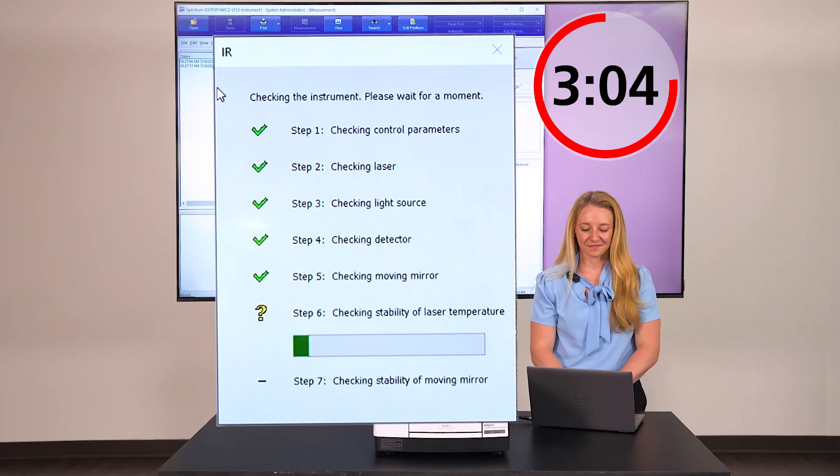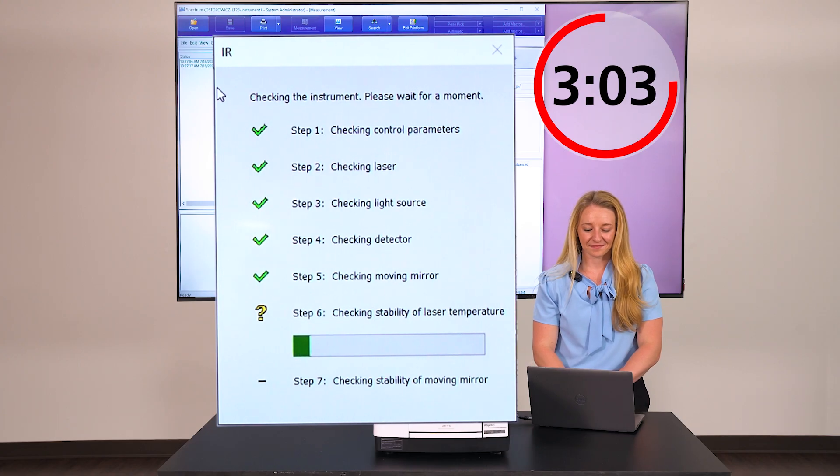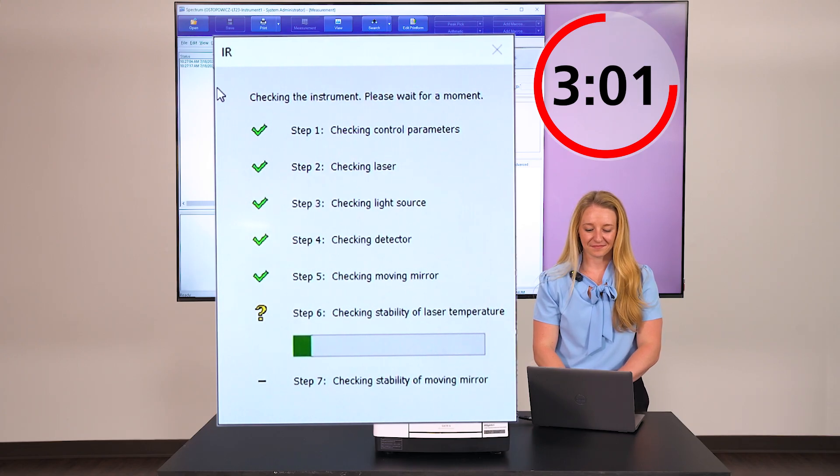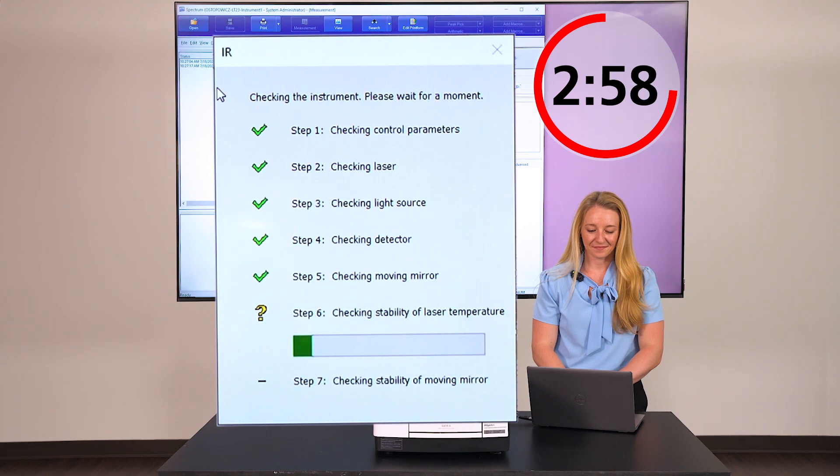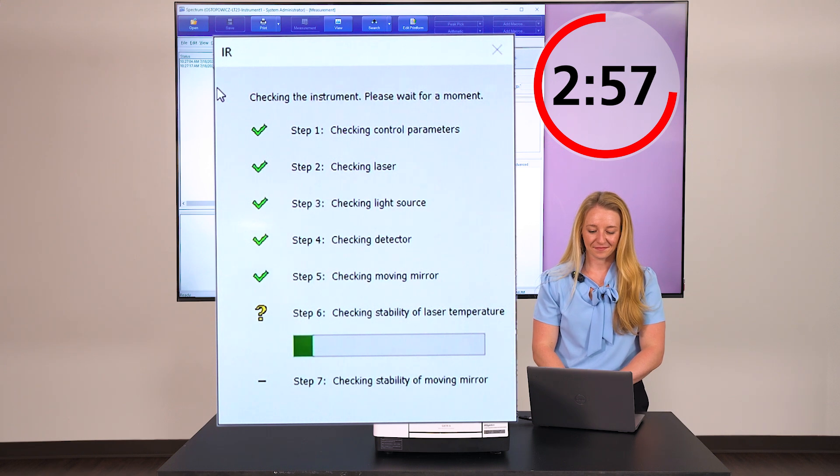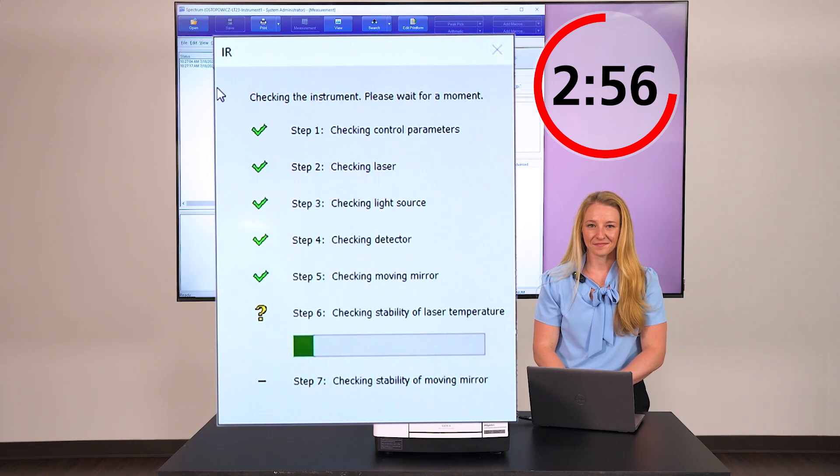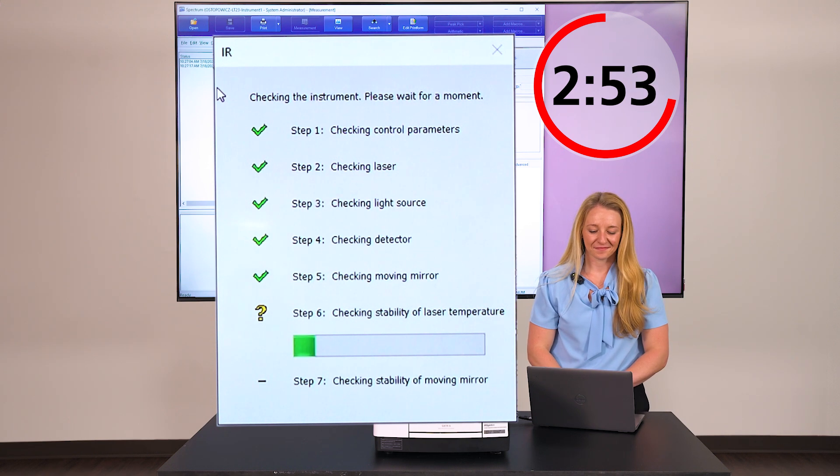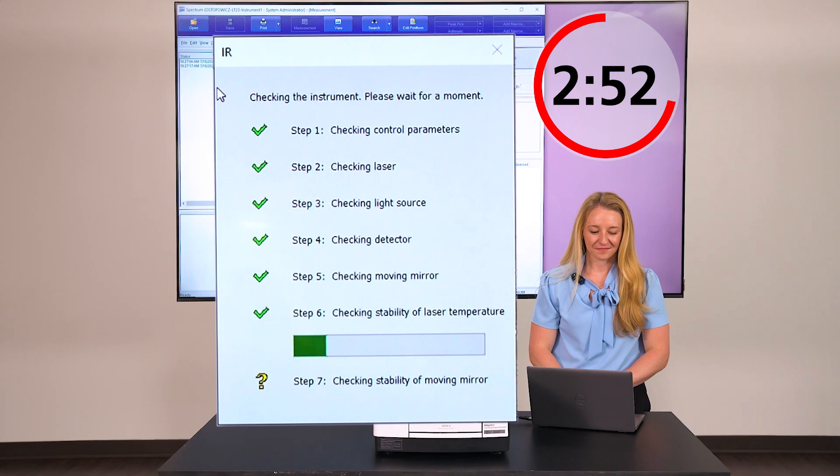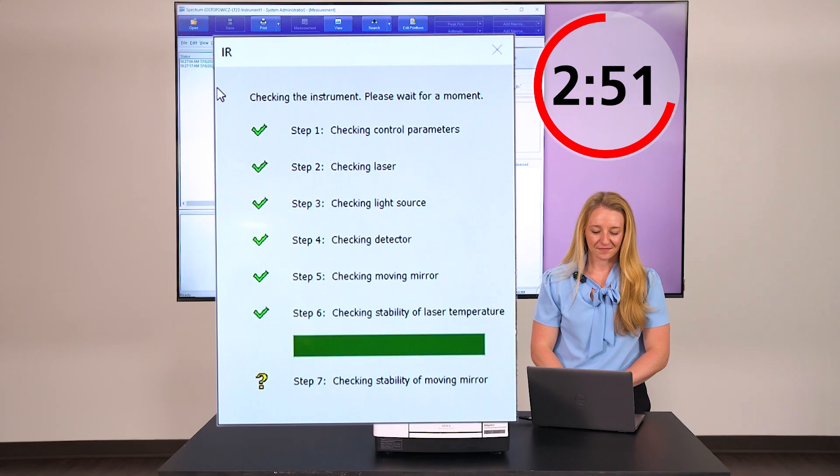However, an accurate FT requires accurate knowledge of the interferometer's optical positions. A reference laser is used to ensure precise and accurate optical alignment of the interferometer by producing a sine wave that the system compares to a stored optimal signal.